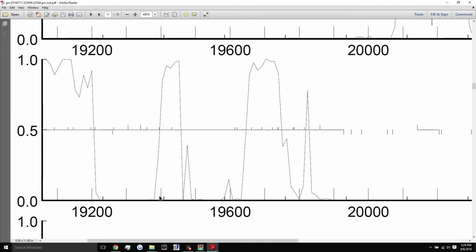So let's say, for example, if this spike extended out here past our start site. If our start site was this ATG uptick right here, we would obviously have the wrong start site according to this graph, because all of the spike area is not included between the start site and the stop site. So in this case, if this was our start site, we would say does not capture all coding potential, and we would reconsider our start site, and maybe we would find that in fact it was this one.